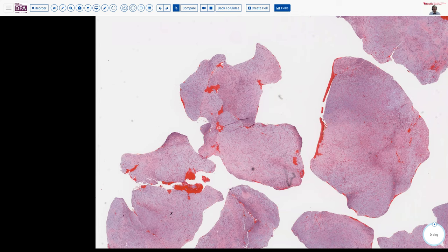And then the question about how do we produce a large slide with all the tumor in it? Well, you get good decalcification and you have good histotechnologists who are comfortable working with larger sections. These were processed, of course, still in standard cassettes of roughly 3 by 3 centimeters. So they're not that huge in that regard, but we did get good sections from our histotechs.